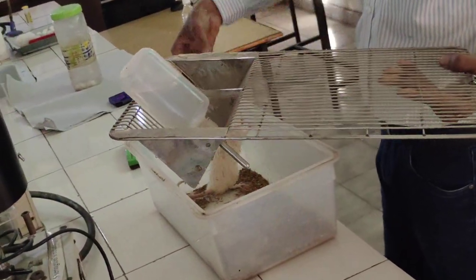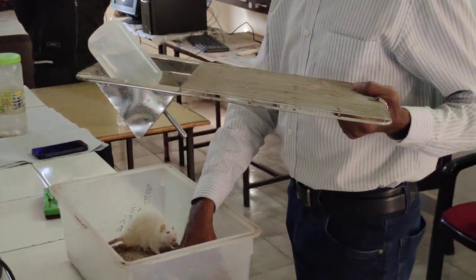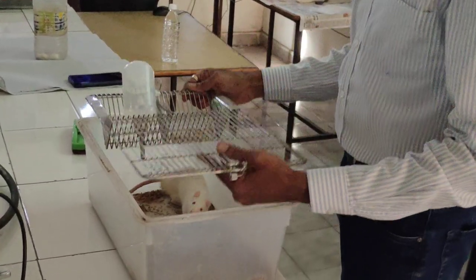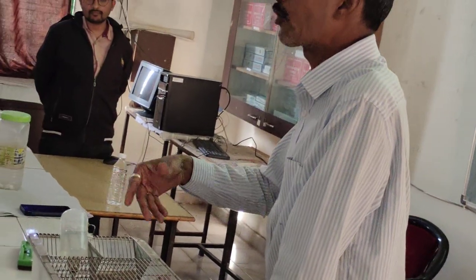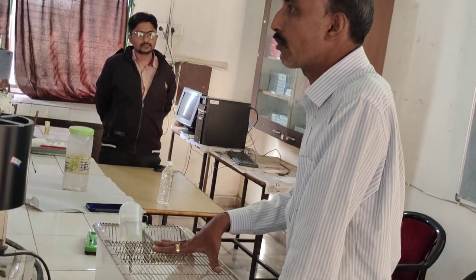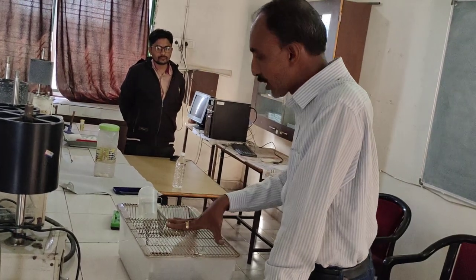Bedding is required. This is the bedding. This is for the absorption of urine and fecal matter. If the bedding is not there, then automatically the animal will be affected by the urine and other fecal matter, and the animal will not get a proper environment to stay in the animal house. So this is the most important thing.